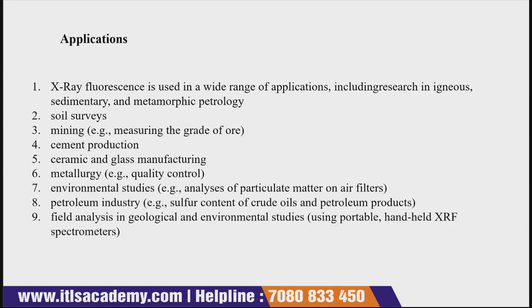Now moving to the end of the lecture, that is the application part. X-ray fluorescence is used in a wide range of applications that include research in igneous, sedimentary and metamorphic petrology. Whenever you want to survey soil, this application is widely used. In mining, whenever you want to measure the grade of an ore, this technique has huge applications.